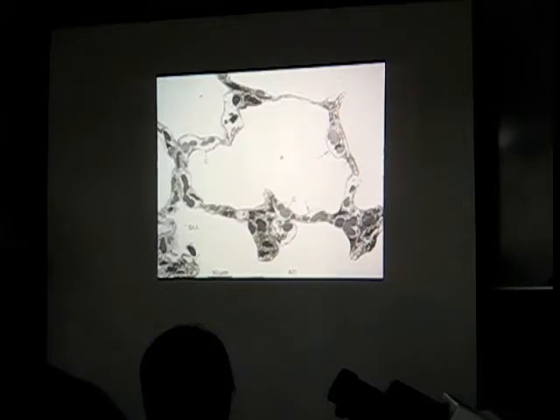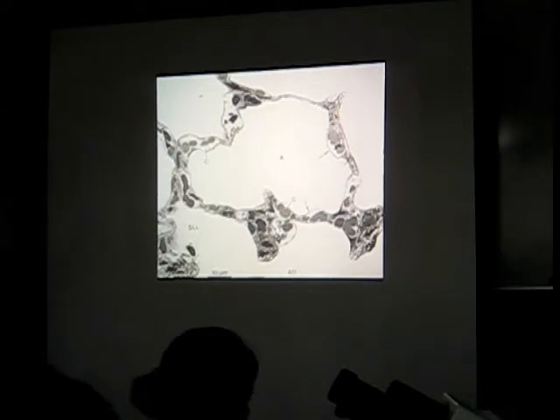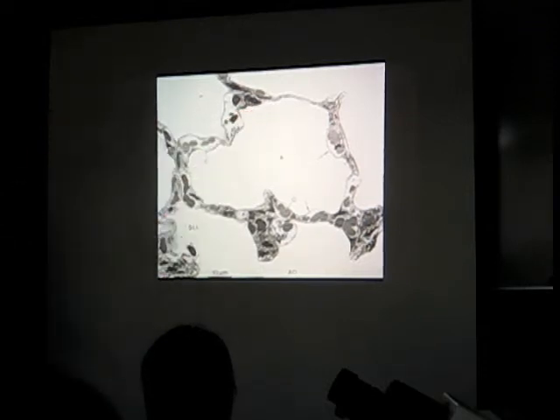what kind of pneumocyte? Type 1 pneumocyte, a basal lamina produced by the type 1 pneumocyte, and what? Endothelial cell. All right, good. What else? Can we see anything else here? That's probably a type 2 pneumocyte. See those granules would make me want to speculate that those granules are the surfactant.